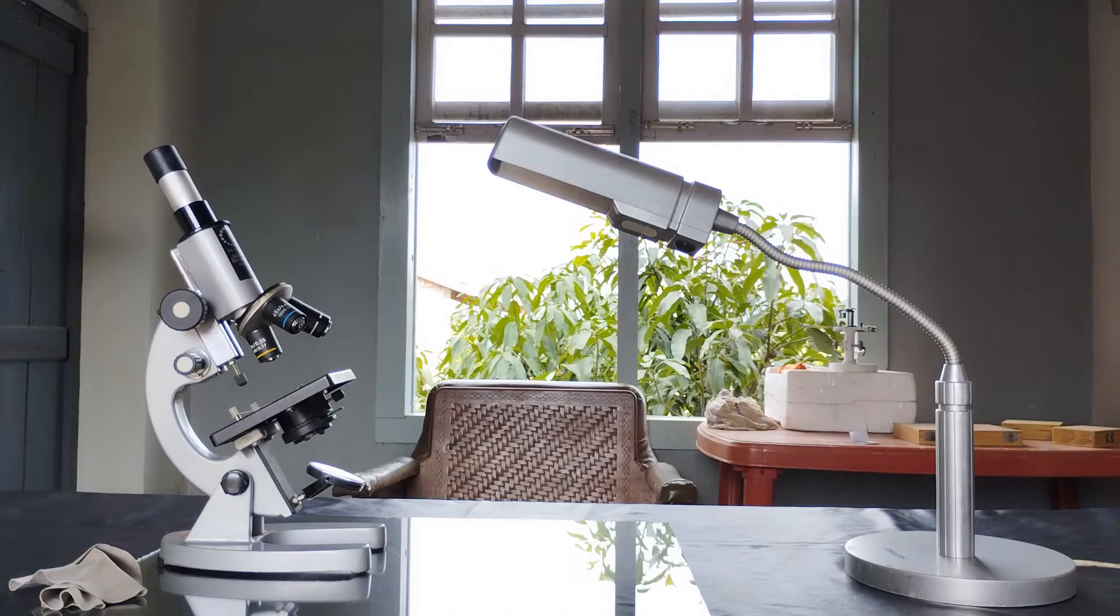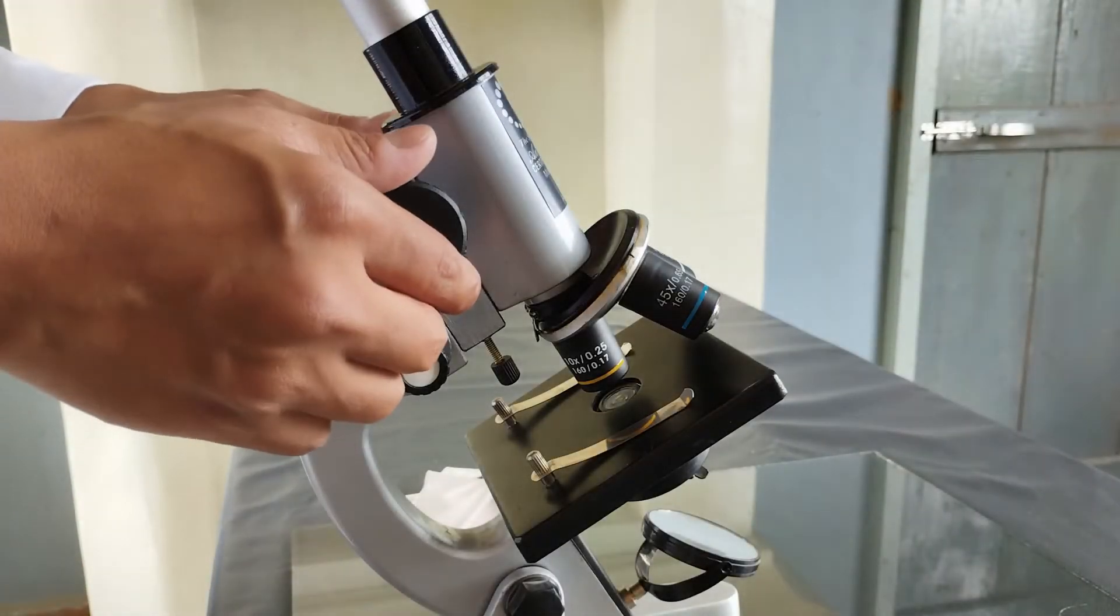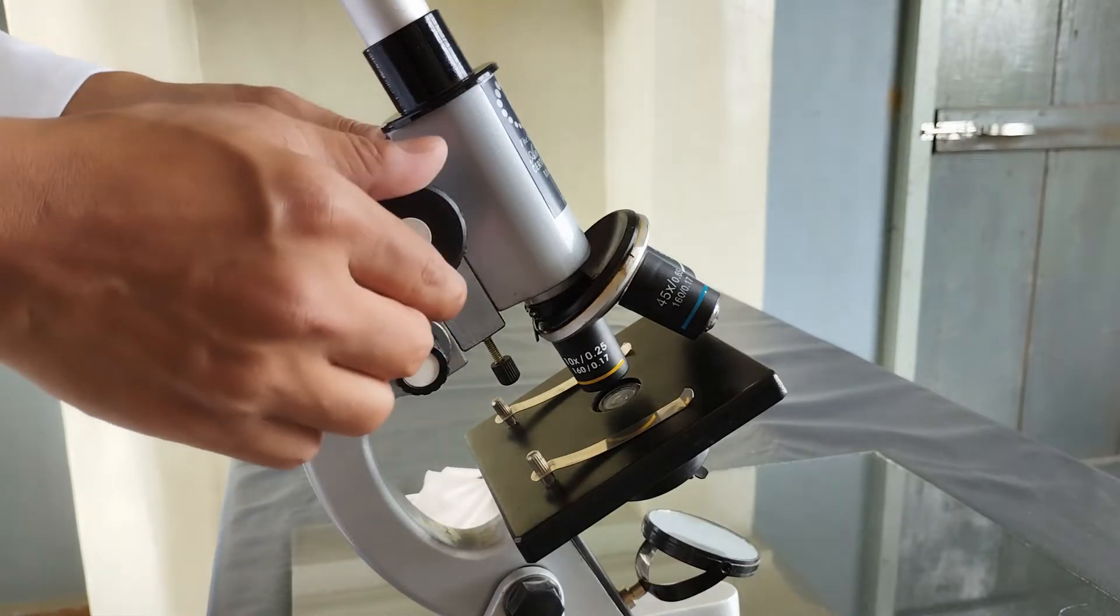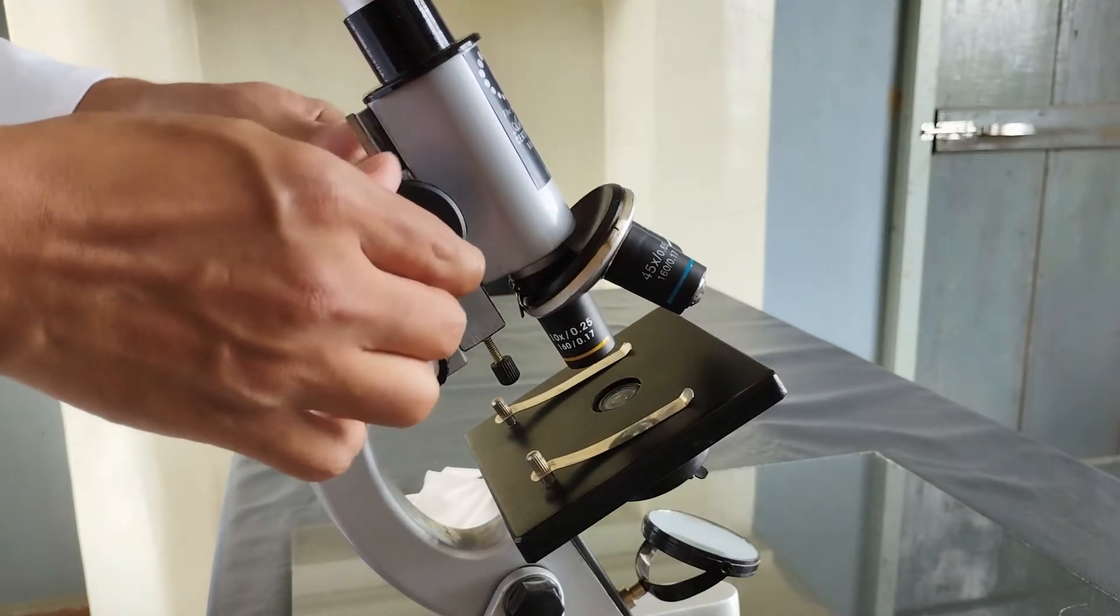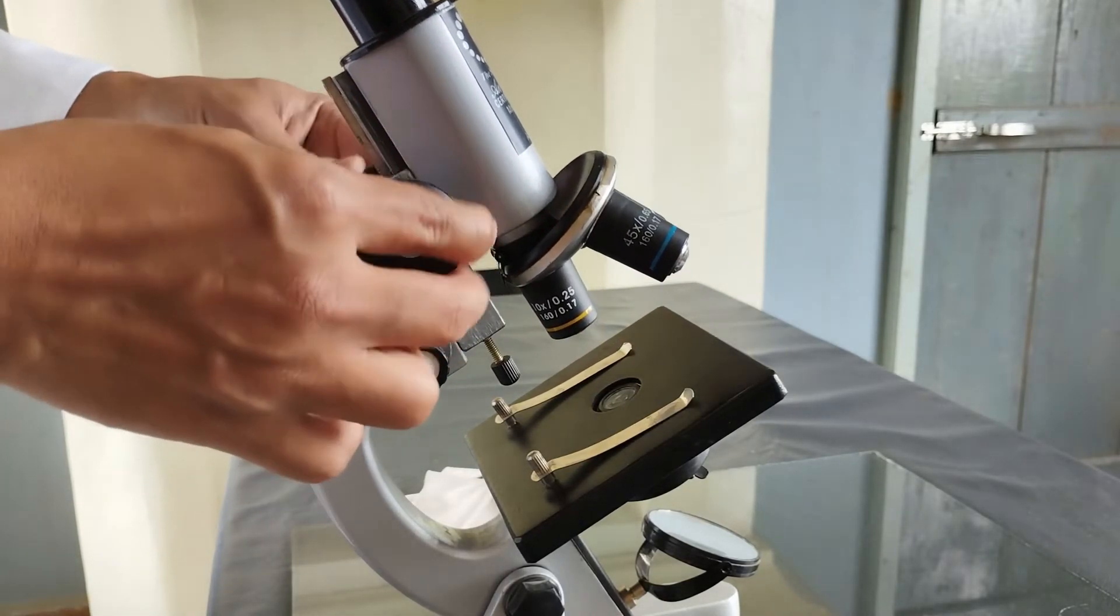The microscope is now ready to be used. For specimen viewing, first rotate the coarse adjustment knob in order to bring the objective lens to its highest or farthest possible distance from the stage.